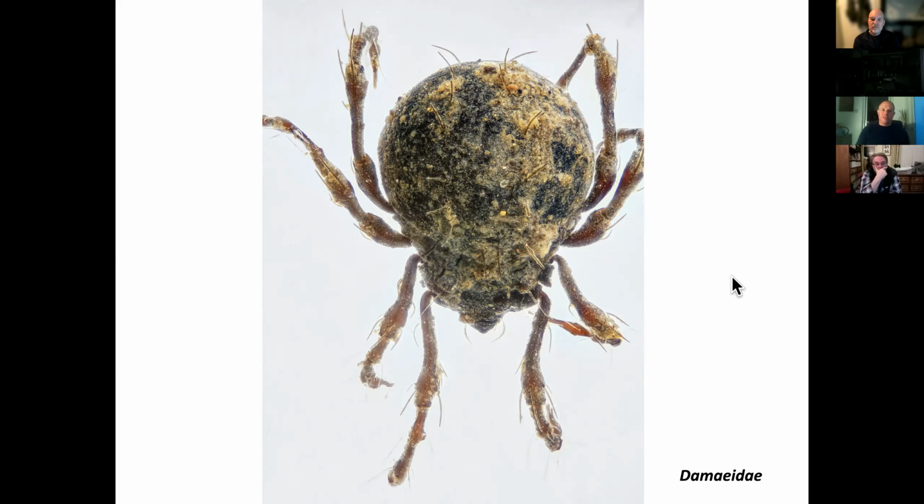You need to look at the setae on the leg segments, and count them up and work out whether you have certain paired setae or not. That in itself can be a bit of a pain. So again, you'd be looking at trying to get 400 times magnification. And to be honest, you often end up either having to photograph it from many different angles or draw little temporary diagrams to work out where the setae are.